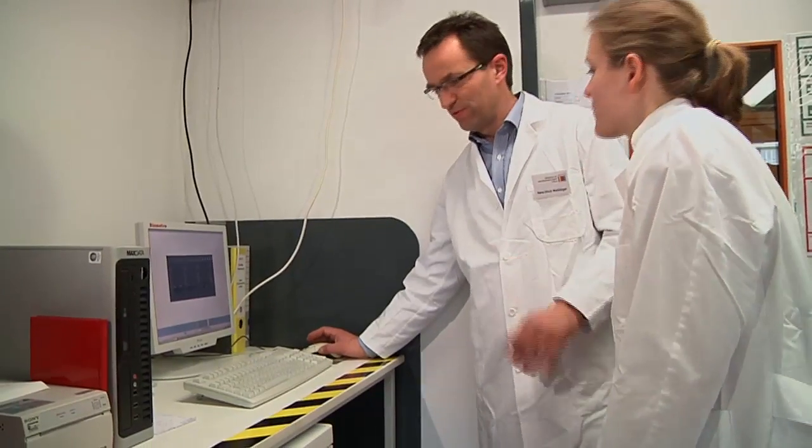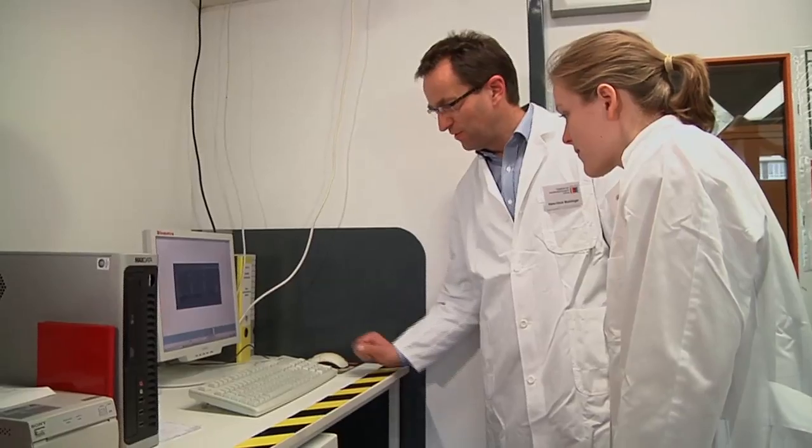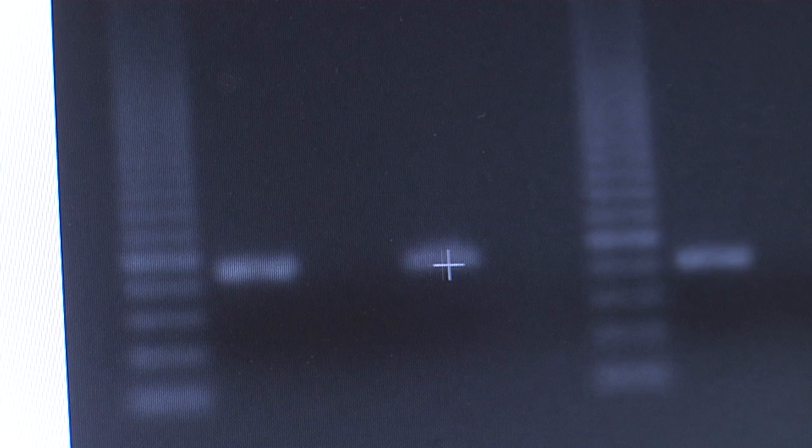Well, let's say we can suppose that it does. Our control experiment with genetically modified maize is positive, as we'd expect, but the same fragment has also formed in our sample. The question remains as to what maize variety this is — whether it's the genetically modified maize variety MON 810 and how much of it is present. In order to find that out, we need real-time PCR.